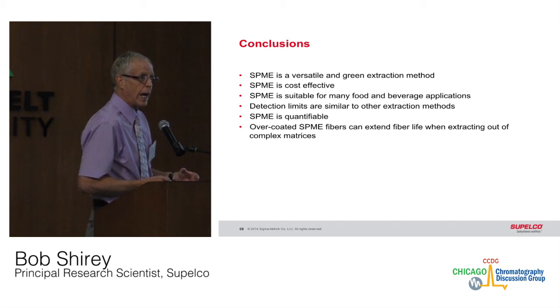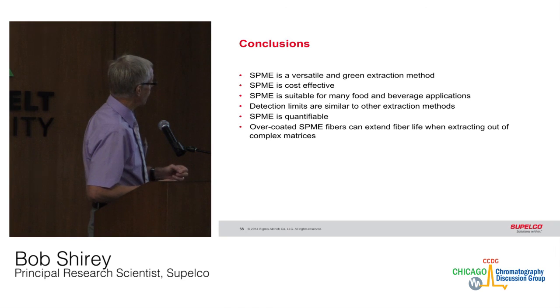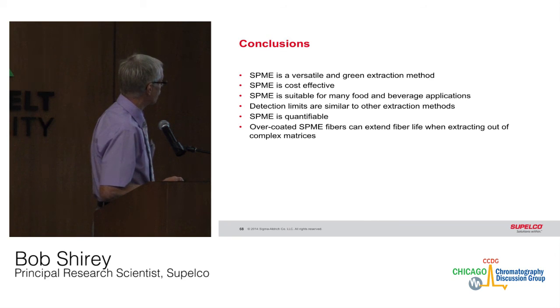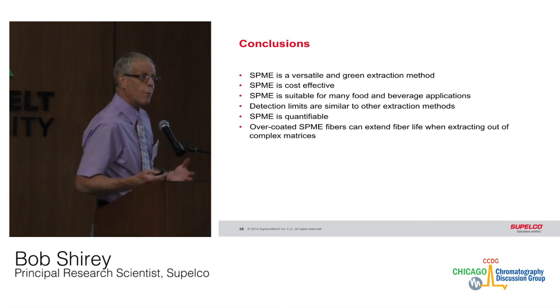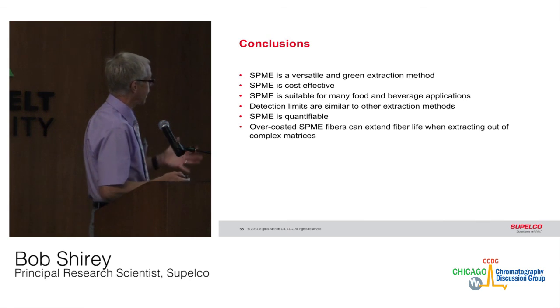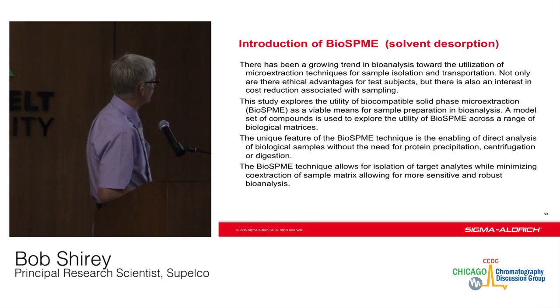Compounds with really high log P values, such as DDT and other chlorinated pesticides, tend to bind even more harshly to the matrix. So it can be quantifiable. It does produce cleaner chromatograms. We've compared it to QuEChERS, and there are some advantages to it, but it does have its limitations. But it can help you if you're looking for specific compounds.